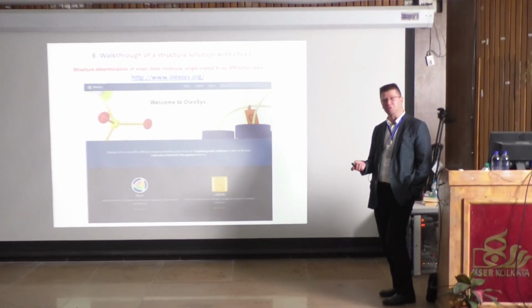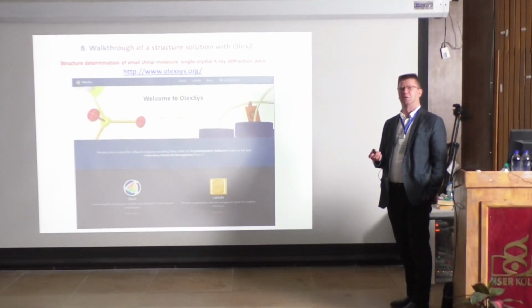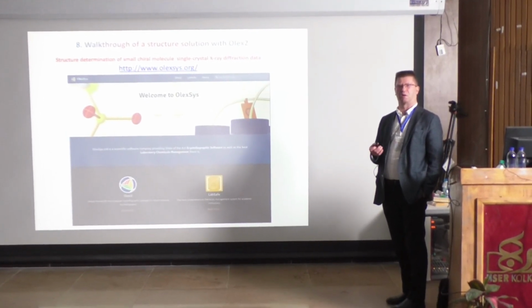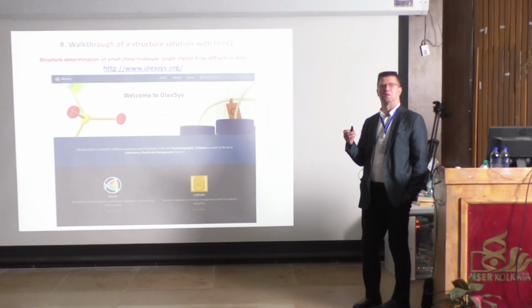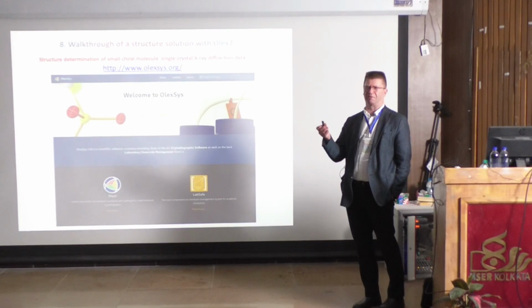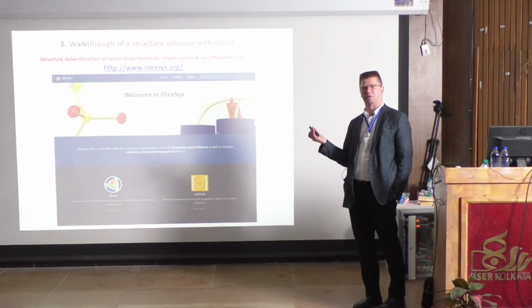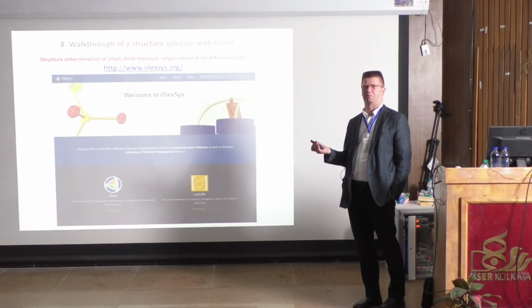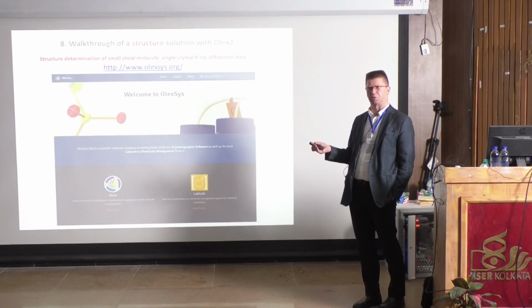You don't have to, but if you are interested or you use X-ray diffraction in your own work and you are willing to do the work yourself, there might be a service, a measurement, where they provide you the data, but if you are given the data with this, you should be able to do it yourself. Because it's not enough that you just do the structure, you have to be able to analyze the structure also. And this we will do tomorrow.